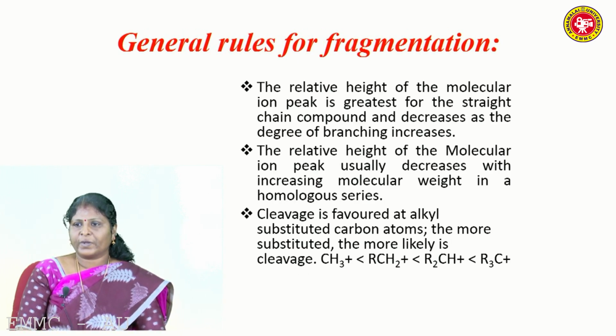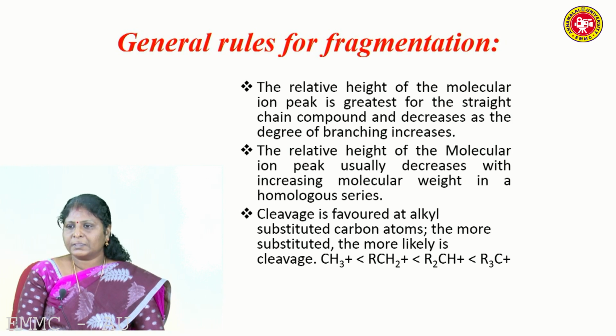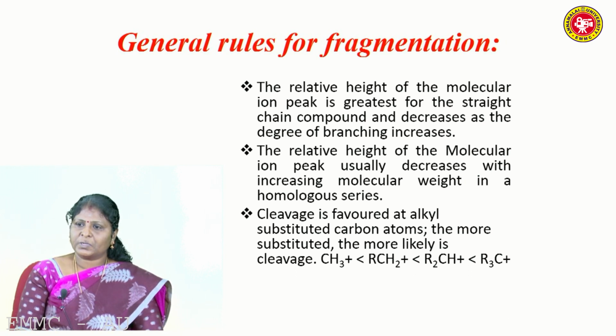Next, general rules for fragmentation. The relative height of the molecular ion peak is greater for straight chain compounds and decreases as the degree of branching increases. The relative height of the molecular ion peak usually decreases with increasing molecular weight in a homologous series. For example, when we move from ethane to propane, propane to butane, fragmentation is more possible in butane when compared to ethane. In branched chain compounds, cleavage is favored at alkyl substituted carbon atoms. The more the substitution, the more likely is cleavage.